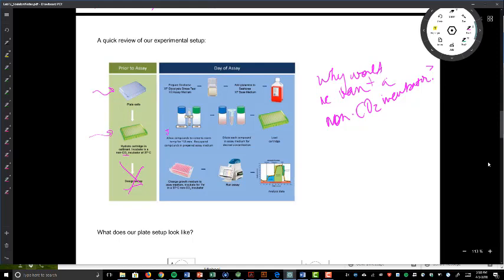So this would be the glucose, the oligomycin, and then the 2-DG and oxamate. Or I may have those prepared ahead of time, I'm not 100% sure. But then you'll dilute the compound to the right concentration, put it into the cartridge, and then we'll load the cartridge.